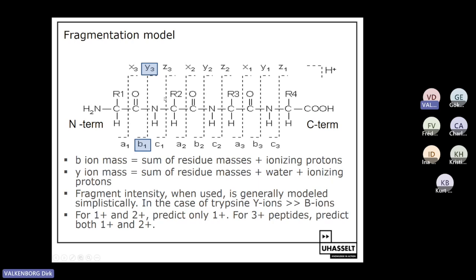And that's good, because what we are playing here is the population game. We don't fragment one of these peptides. No, we will have thousands of these peptides that are being fragmented. And yes, there is a propensity for a proton to attack a bond and fragment at a certain position, but there is also a semi-stochastic process behind this.